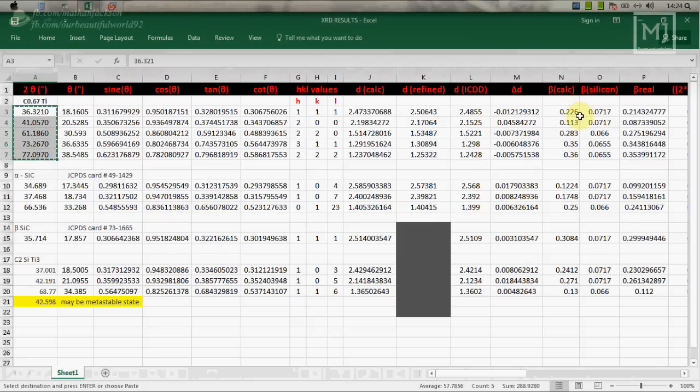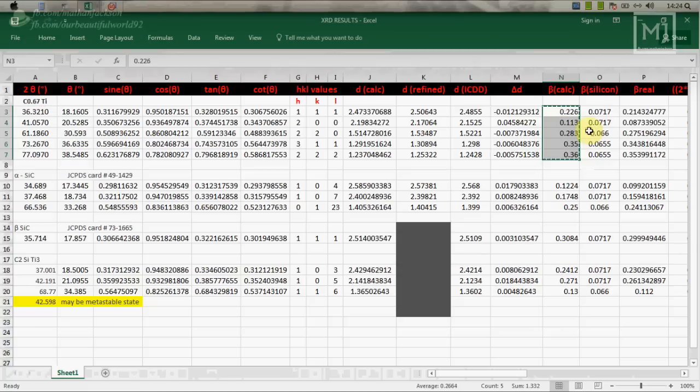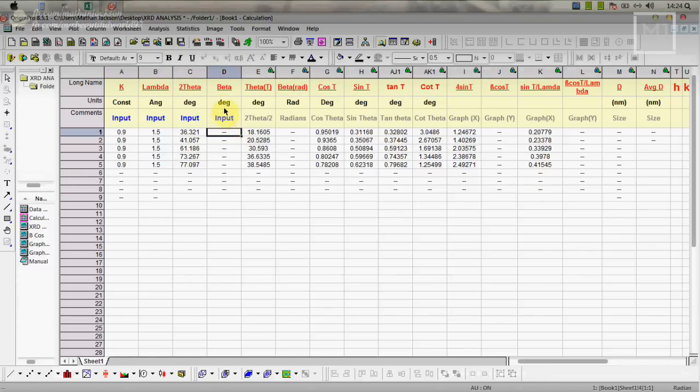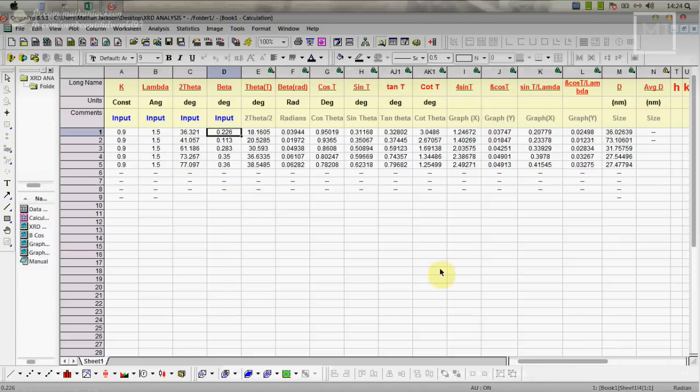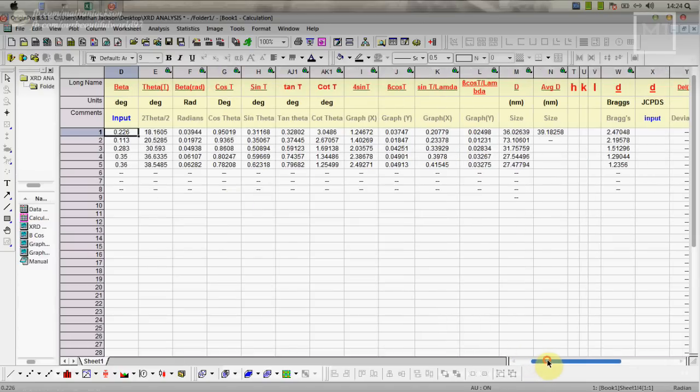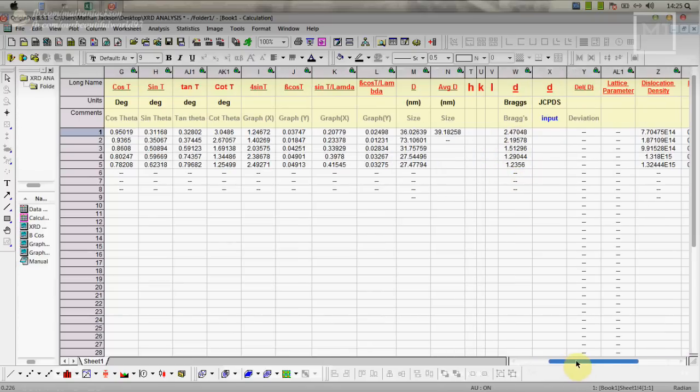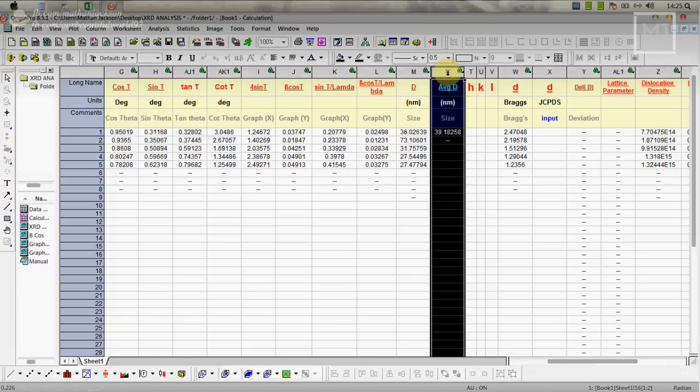Now we need beta calculation value. This is the FWHM so we are copying here, put it in this beta section, paste. Now we are getting all those values: theta, cos theta, sine theta, tan theta, all steps. From beta degree it is converted into radians. After these all calculations, here D is coming, the particle size.